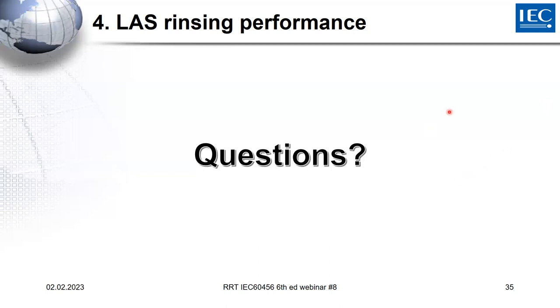Hi, I have another question. Yes. I cannot see it on the draft, but do you need to do some cuvette check in order to check if the cuvette is good enough to do the readings or not? Let me have a look. It's recommended that if you use a lot of different cuvettes, you should check if they all have similar behavior, either by just air or with water, and that they give the same output with an empty one, with a blank. I'm not sure if we still have it in. We used to have it in, as far as I remember.